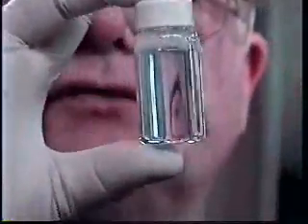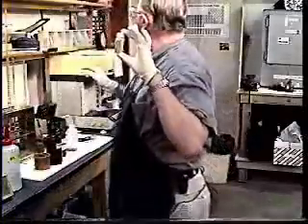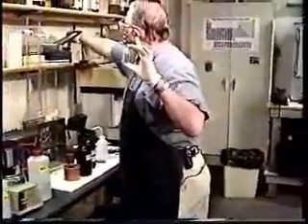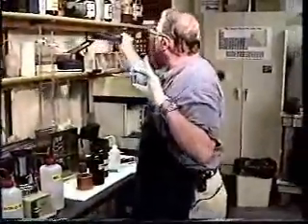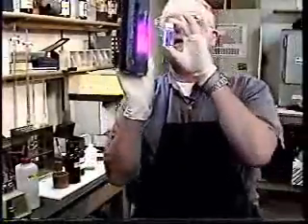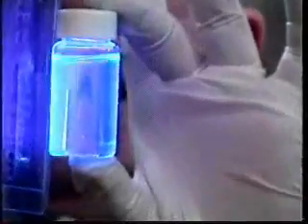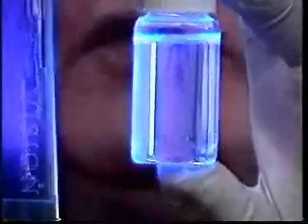There we have it. Right now, let's shake it up. If we put this in an ultraviolet light, in fact, maybe I can do that. You can see how that fluoresces with the ultraviolet light.